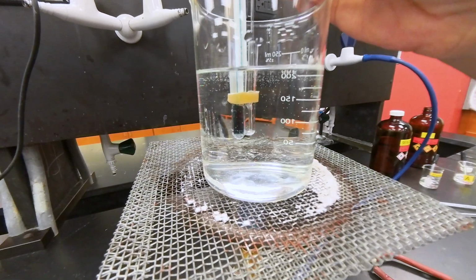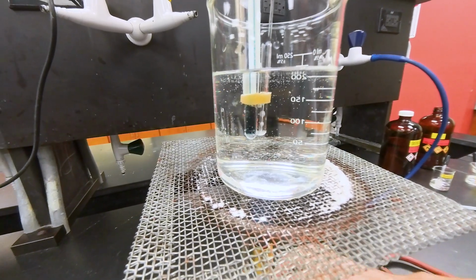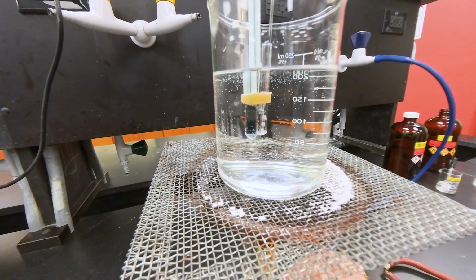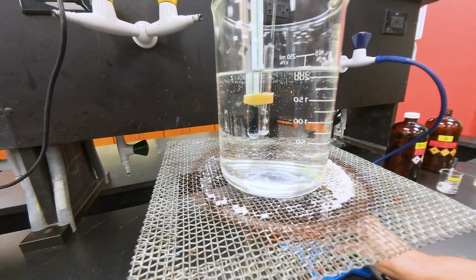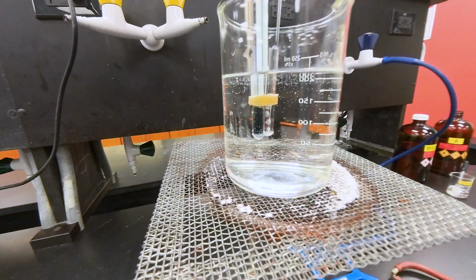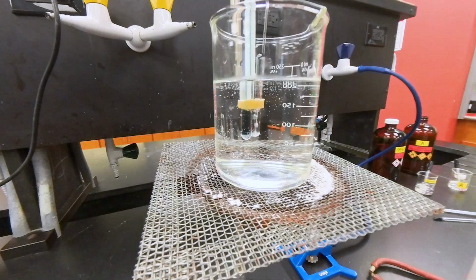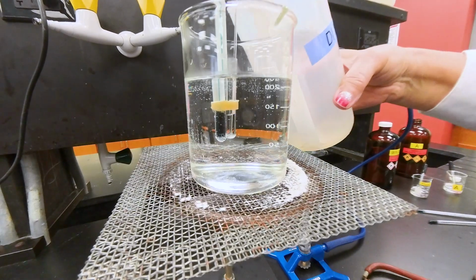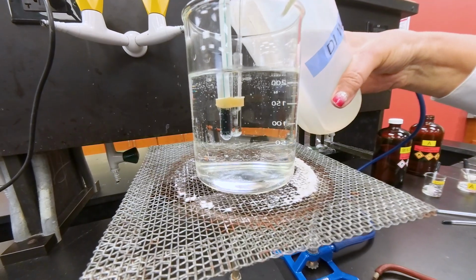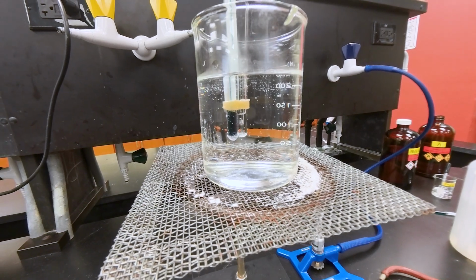Okay? You should see that the line is coming out now. It's not separate bubbles. It's a line. The temperature now is at the boiling point or higher. I turn off the Bunsen burner and wait for it to cool down, and it comes to about one bubble at a time. That's going to be very close to the boiling point of the sample. You don't have to add water. I'm just adding water to make it faster for recording purposes, so you don't have to watch the video for too long.